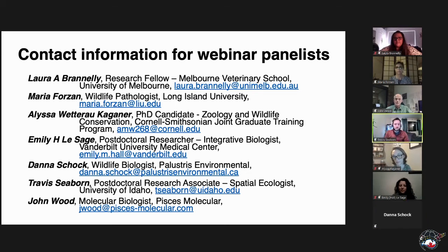Yeah, so in terms of starting with practical things to focus on, my take-home message, and I appreciate Laura sent the slides around, I was like, please underline this, because one of the things that I think is really important for the field, and it also goes into the lab too, is to really be careful and think about what your positive and negative controls are before you actually get out into the field, because collecting those and doing those things properly in the field and in the lab is something that, unfortunately, if you don't do right, can kind of doom your study a little bit, in terms of being big red flags for a reviewer.